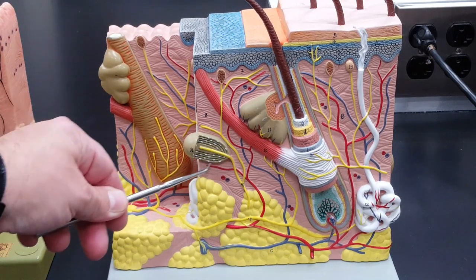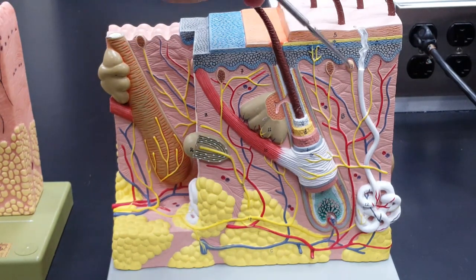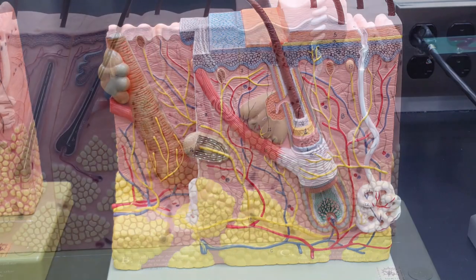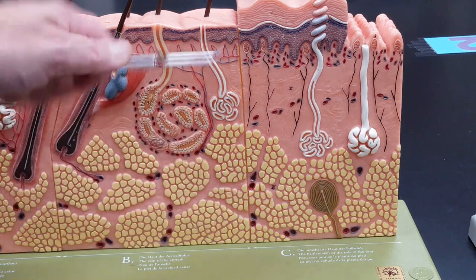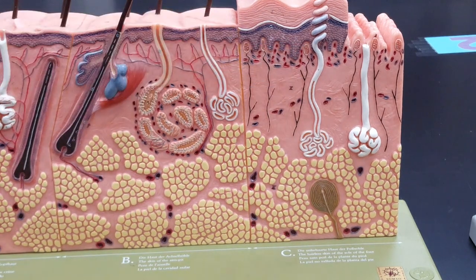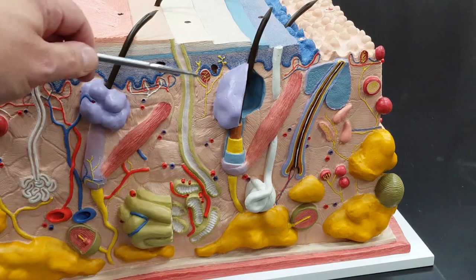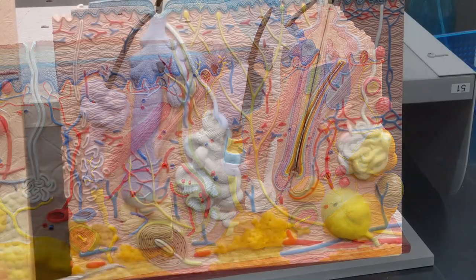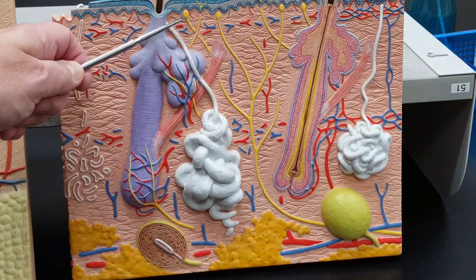Lamellated corpuscle, notice the rings down in the dermis. Tactile corpuscles here, here, here, nestled up in the papillae. A lamellated, again, rings corpuscle here, and tactile corpuscles here and here and here, up in the papillae. Look for those differences. Lamellated corpuscle, tactile corpuscle. Lamellated corpuscle, tactile corpuscle.